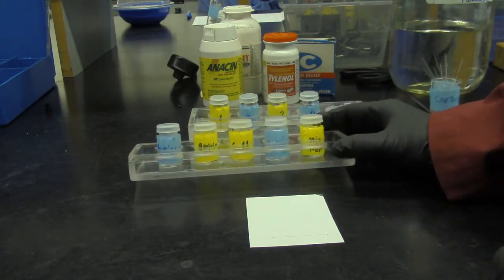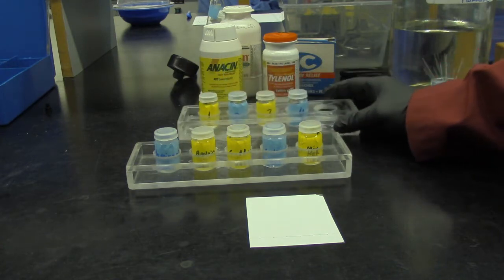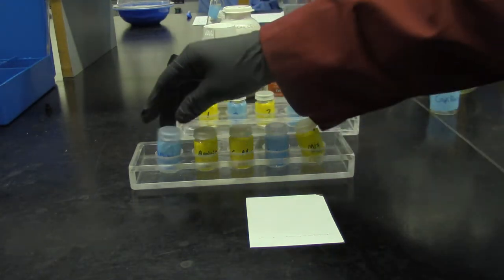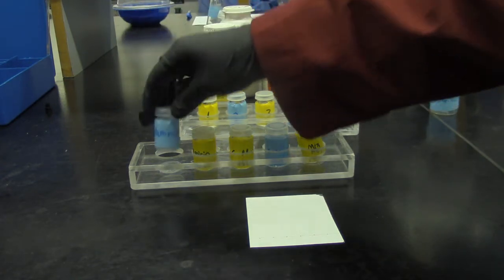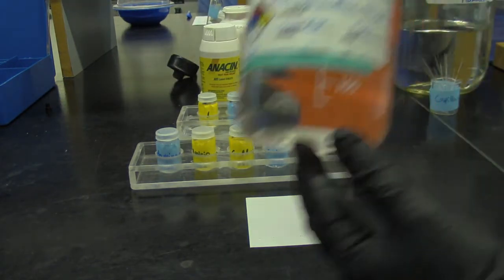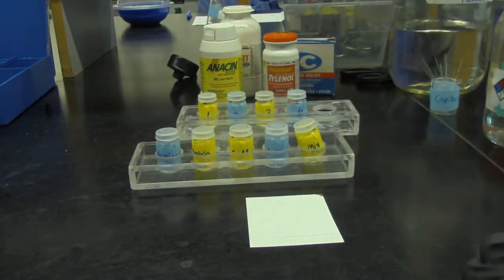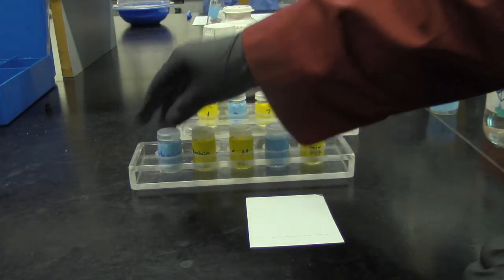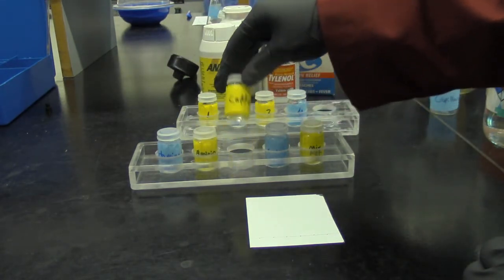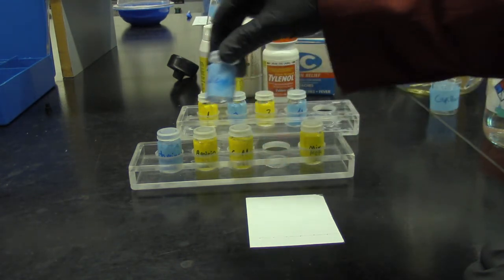So I've prepared all the standards and the unknowns as well. I took 0.2 gram of acetaminophen and dissolved it in a 50-50 dichloromethane ethanol mixture. All these standards are prepared by weighing out about 0.2 gram each and dissolving in 5 ml of solvent mixture.